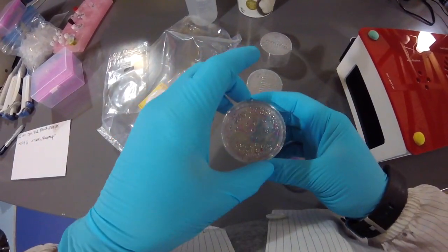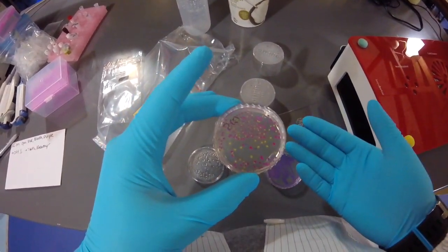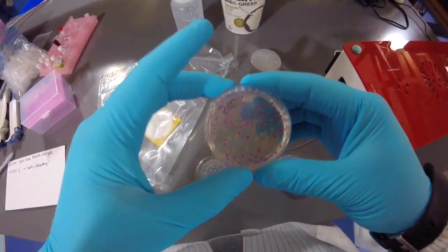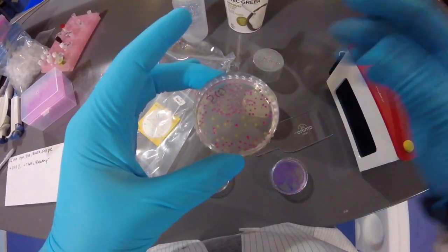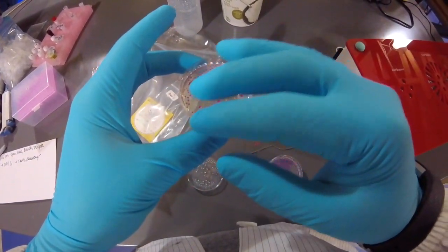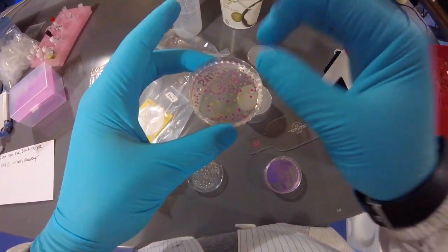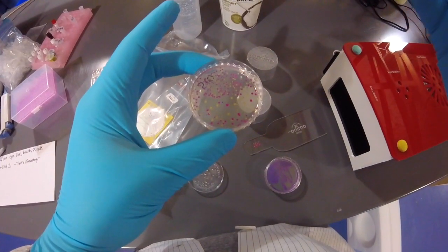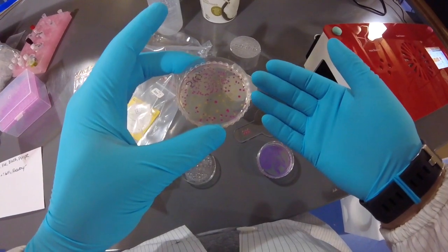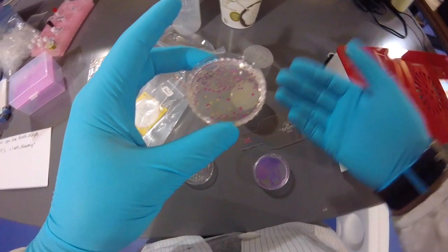And just to emphasize, a colony is a bunch of bacteria, right? You're talking thousands to millions of bacteria that all started from a single one. When you did your transformation, a single bacteria took in that plasmid, and when you spread that single bacteria out on this plate, it grew and divided and grew and divided. So that one cell grew into thousands, if not millions of cells. That's what a colony is: a mound of cells that originated as a single bacteria.